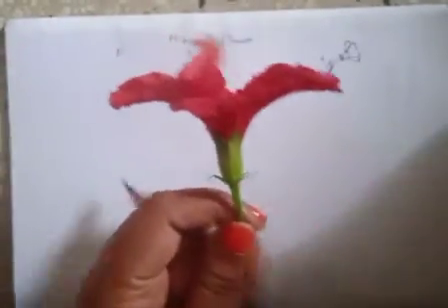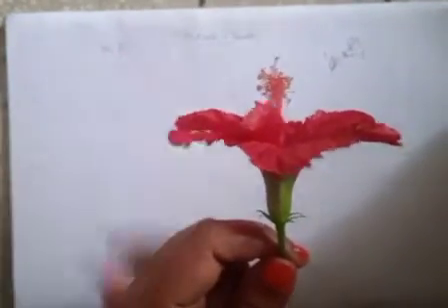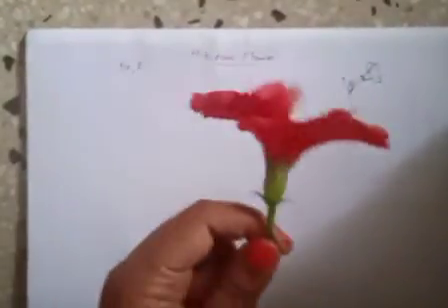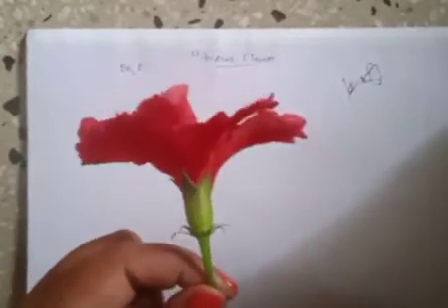So there is a bract in the front, so I will write bract in the front. Then after that, what will be done with this bract? There I need to find the epicalyx. So how many epicalyx are there?